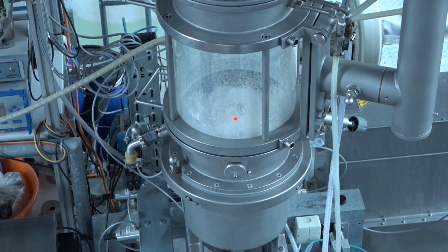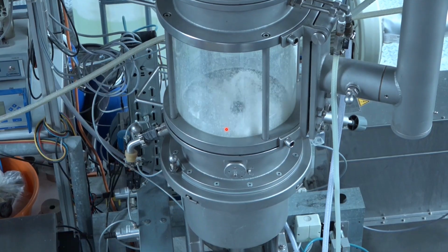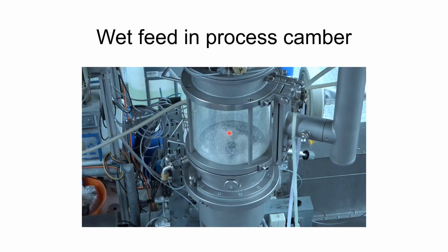Here you have seen it get into the fluidized bed, and then it is mixed immediately with the rest of the material.